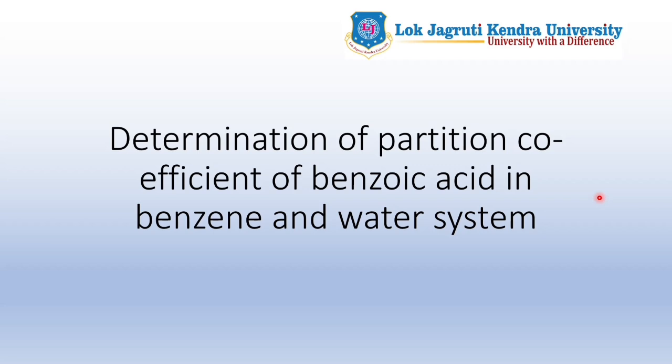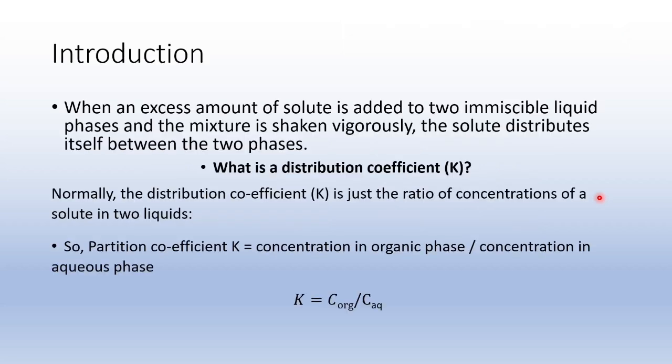In this video, we'll determine partition coefficient of benzoic acid in benzene and water system. Let's have a brief intro about what is partition coefficient. When an excess amount of solute is added to two immiscible liquid phases and the mixture is shaken vigorously, the solute distributes itself between the two phases.